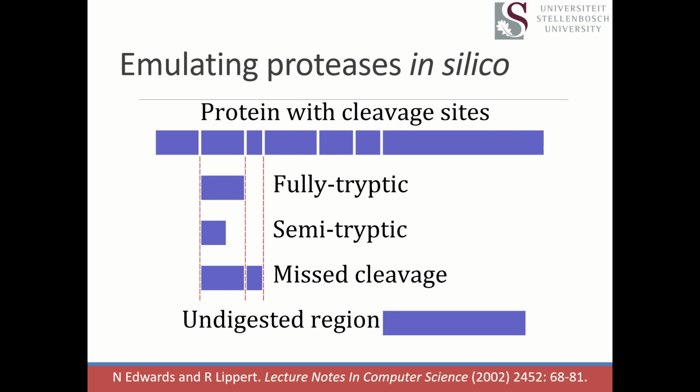That's great. There's another case for that shown up here as well. See this missed cleavage peptide? It ends at a legitimate cutting site, and it starts at a legitimate cutting site, but it also has an uncut arginine or lysine inside it. So missed cleavages can also happen, and they happen with some frequency, in fact, so worth knowing about those.